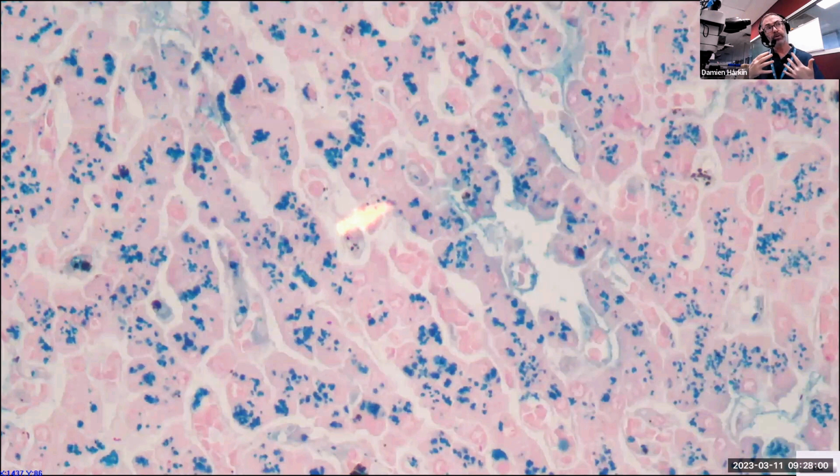In order to cause this reaction, we need to release those ferric ions locally into solution, and that's done using some dilute hydrochloric acid.